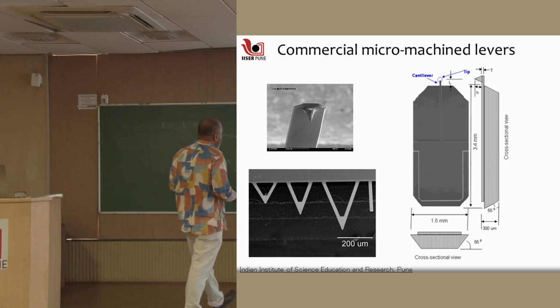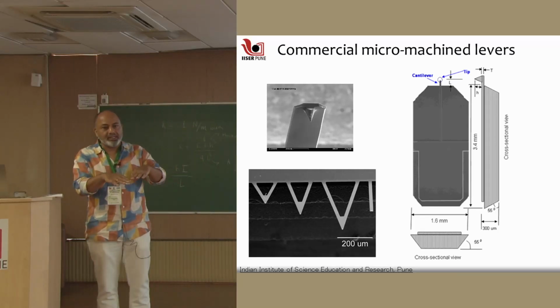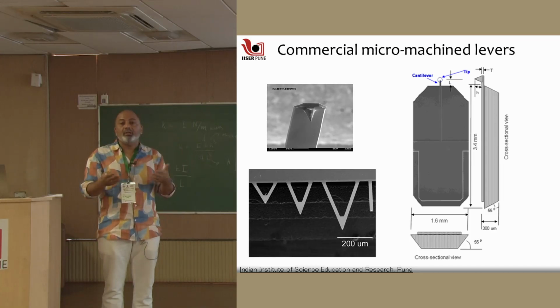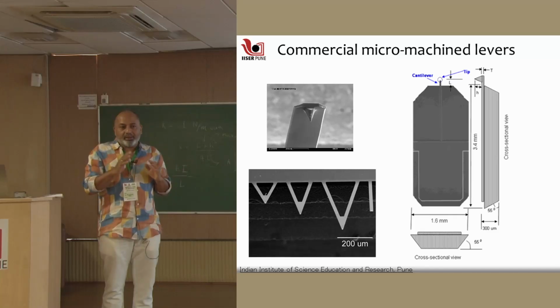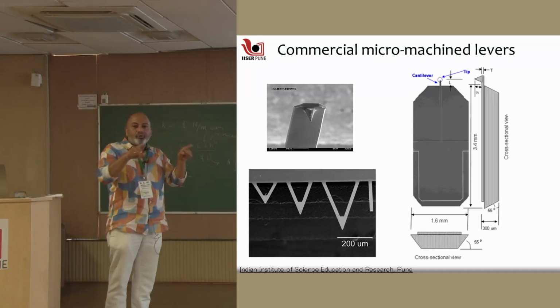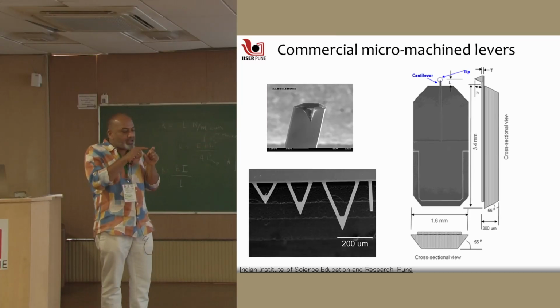So what is now done is that you have a silicon wafer on which you have an oxide layer and another material, and you can use the etching technology, lift it up, all that. This is something beyond me, but by doing all that on one full silicon wafer, you can etch out cantilevers which are much smaller in length.